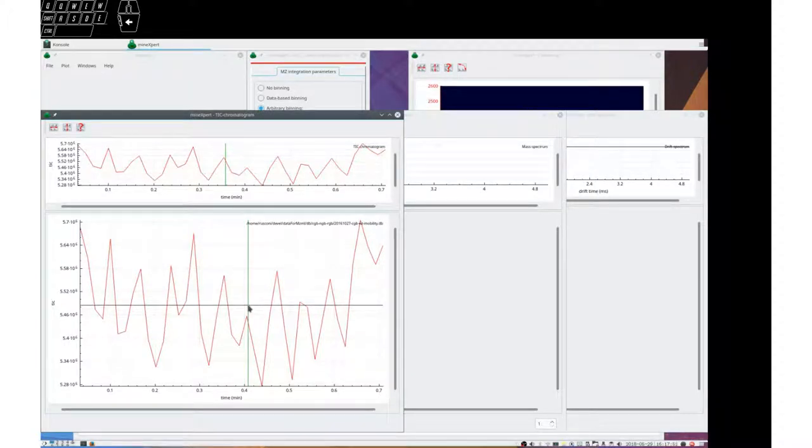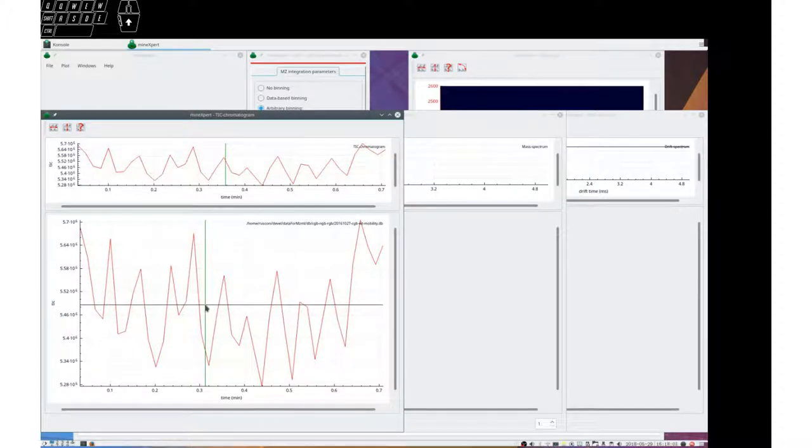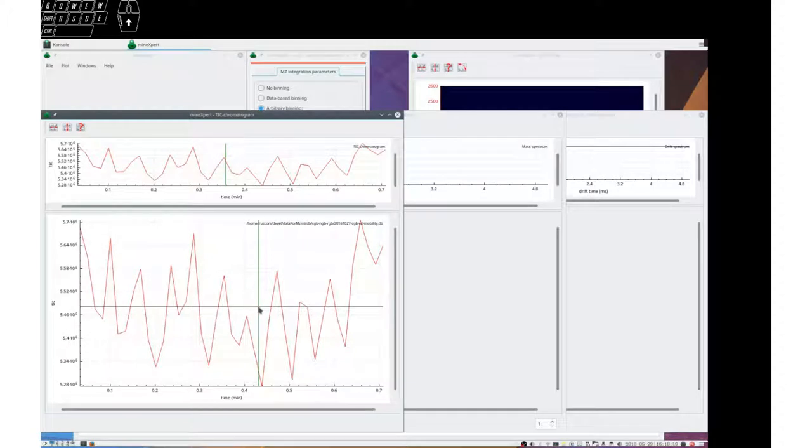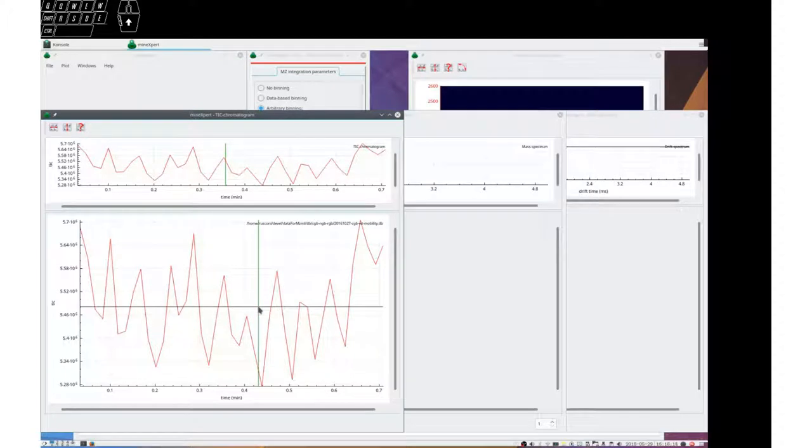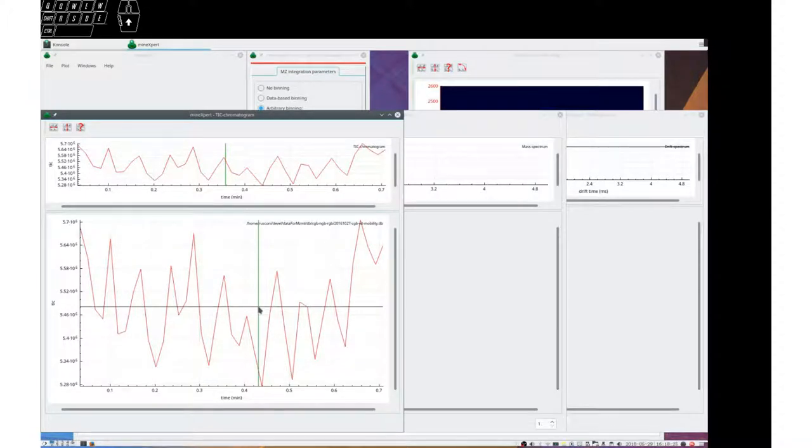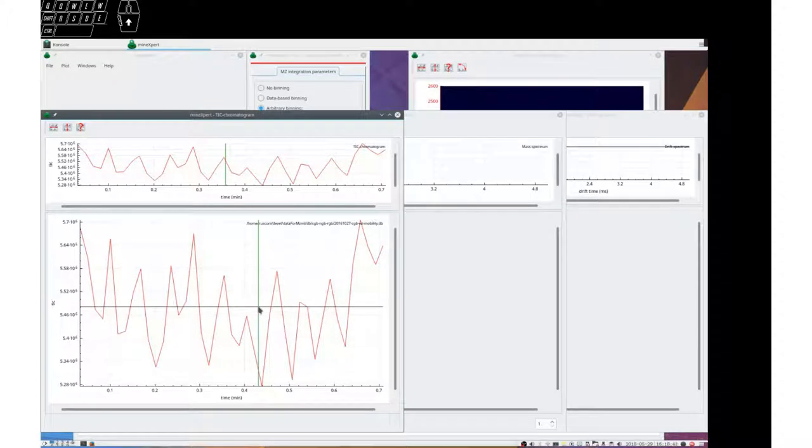I've opened this data file that is an ion mobility mass spectrometry experiment and we are going to look at the various ways to navigate data. First, I want to bring to your attention the small representations of the keyboard and mouse that are located at the top left corner of the video. These representations allow you to monitor the keyboard keys and mouse buttons that are pressed.